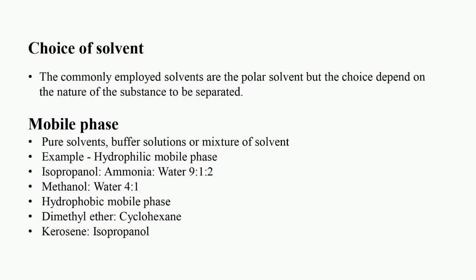Choice of solvent. The commonly employed solvents are the polar solvents, but the choice depends on the nature of the substance to be separated. Mobile phase. Pure solvents, buffer solutions, or mixture of solvents. Example, hydrophilic mobile phase. Isopropanol, ammonia, water 9:1:2. Methanol, water 4:1. Hydrophobic mobile phase. Dimethyl ether, cyclohexane. Kerosene, isopropanol.